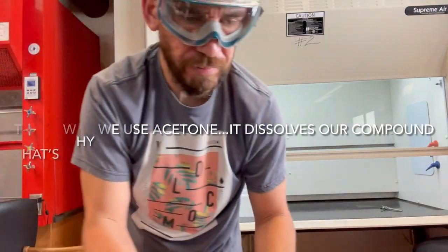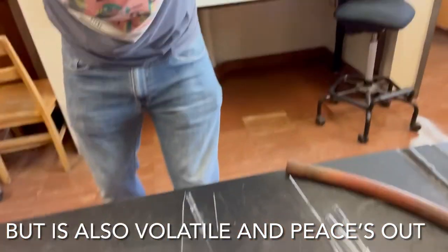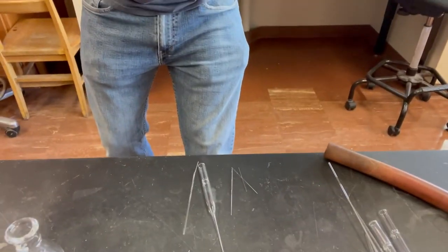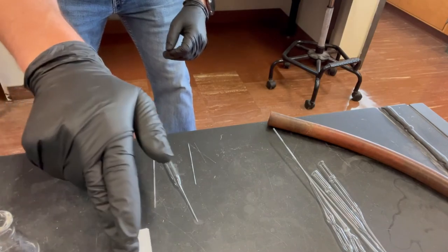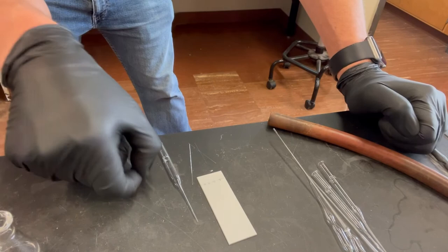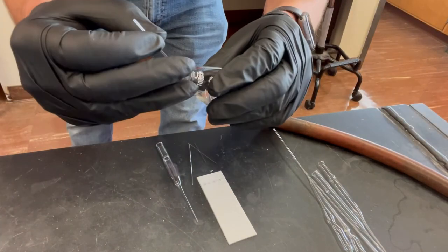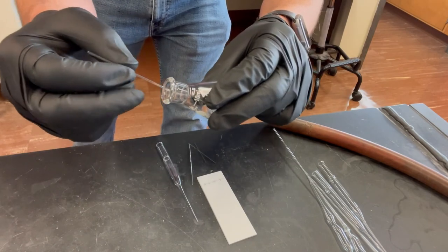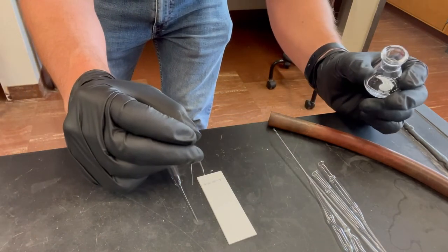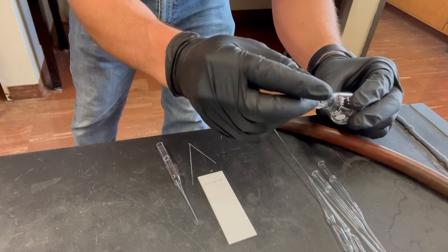Okay, so now what we've got is, let's see if we can do this. You can't see that. I don't know if this is going to be a good camera angle or not. Whatever, I'll go ahead and spot this guy on the right. So I'm placing this in here. You won't be able to see the liquid in here, but you just dab, dab, dab. It's not working. Let's try the other side.